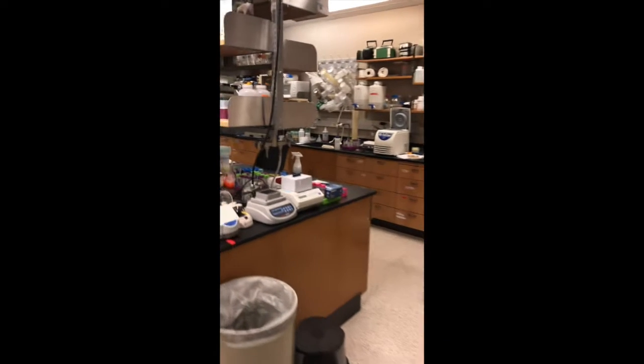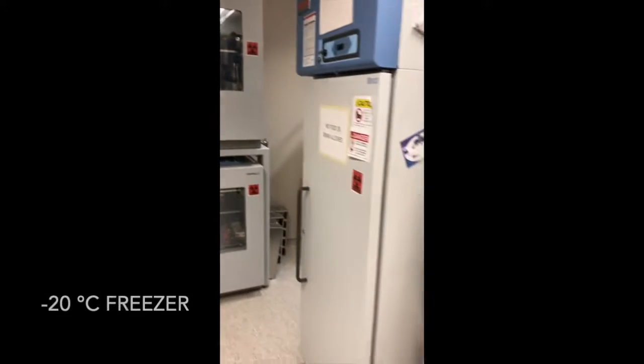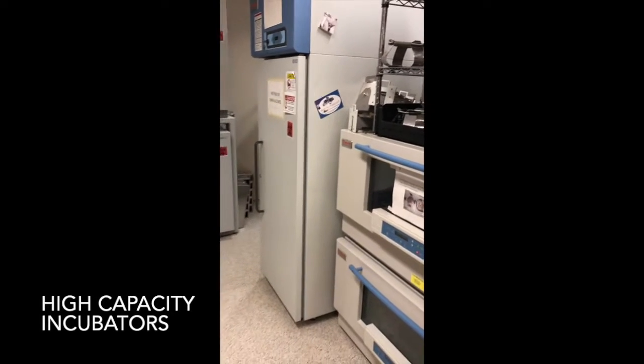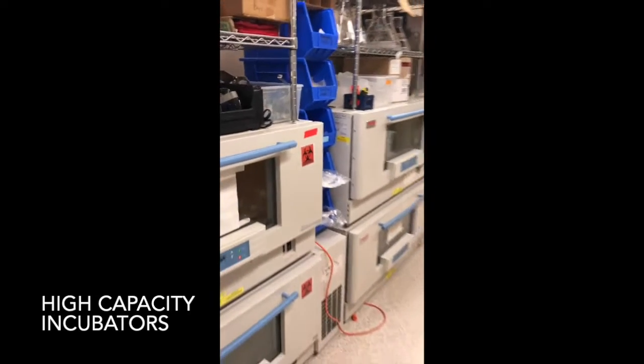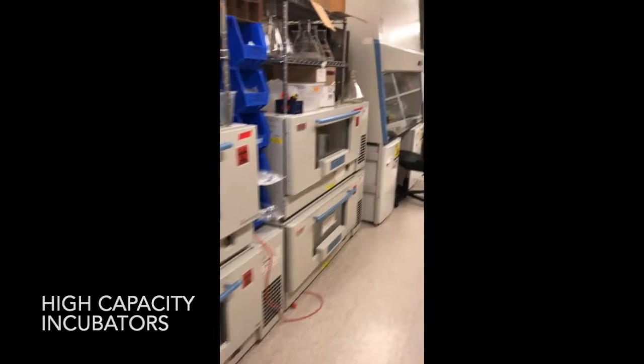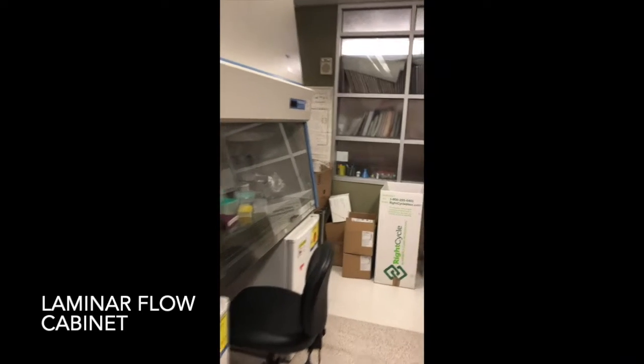As we move into one of the main labs you saw the minus 80 freezer there, here's a little bit better view with a couple vertical incubators next door, minus 20 freezer there. And then of course our large capacity incubators. So this is where we incubate plates for enzyme variants for directed evolution.